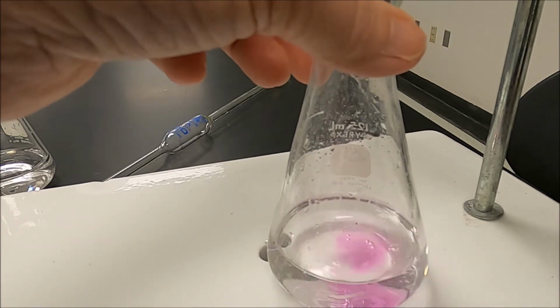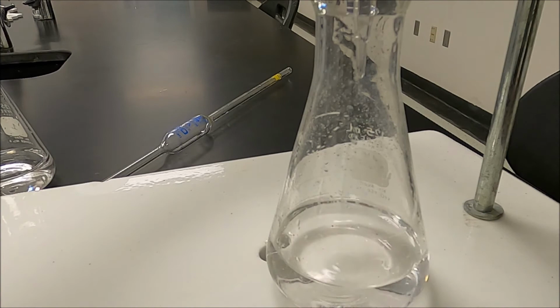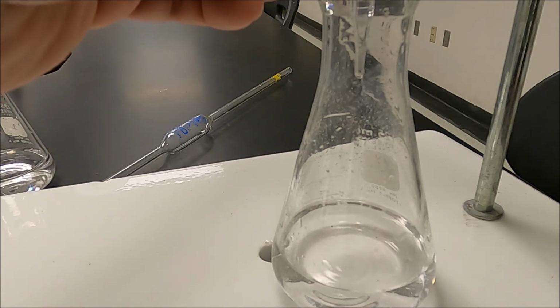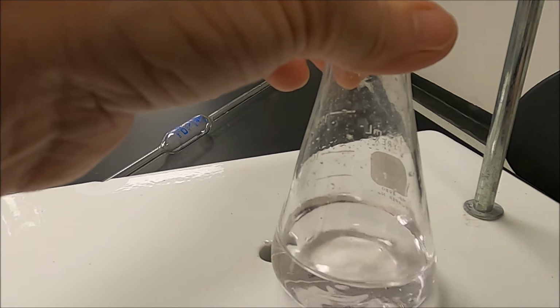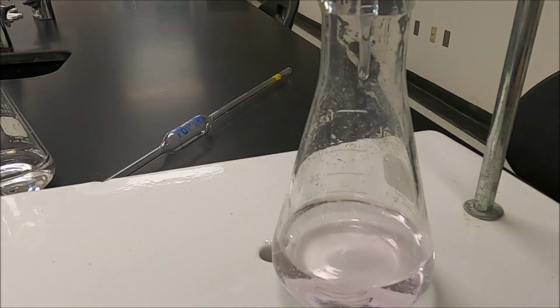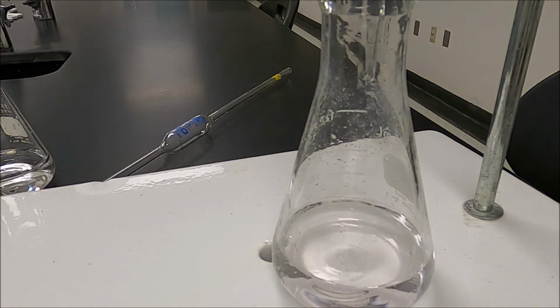See how the pink is getting more persistent? Means it's definitely time for me to slow down. Now I'm just going to let it drop. Okay, probably just a couple of drops. The paler the pink color we can get to persist, the better. We're close, real close. Okay, that pink color is persisting. We are there. So our final burette reading this time is 21.30. That first one may be an anomaly, but that's the way science is, okay?